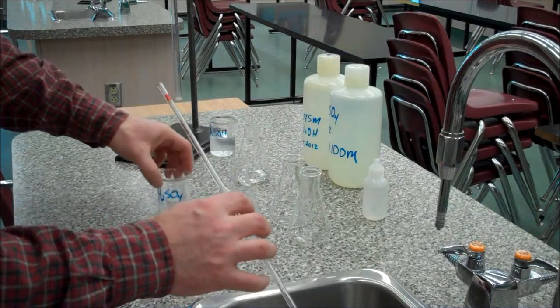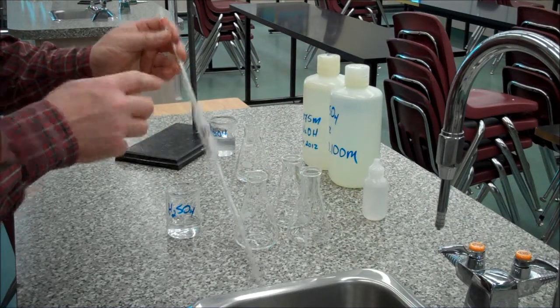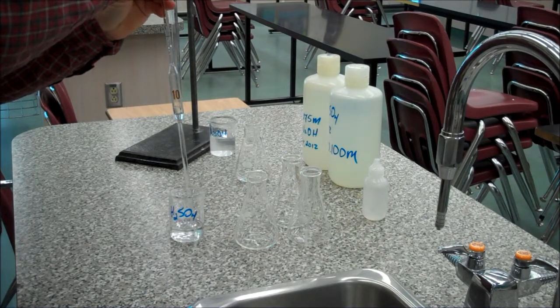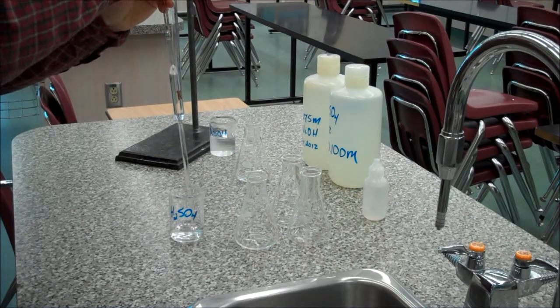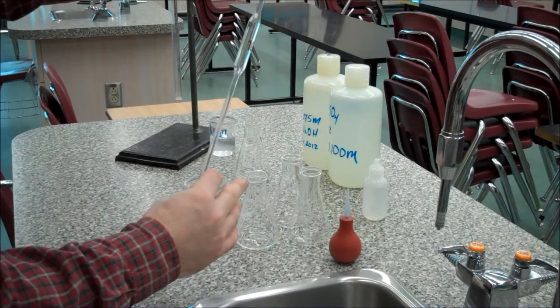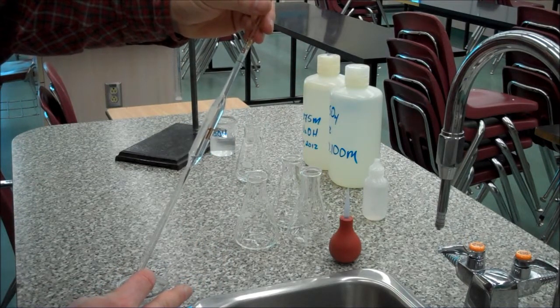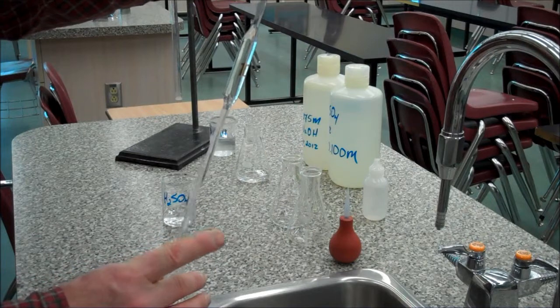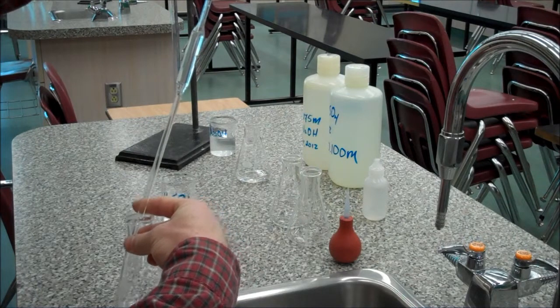Battery wore out. Okay, so I'm going to draw up my fluid above the single graduation and let it draw down. So, tipping the pipette over, drawing up beyond the single graduation, careful not to get it into the bulb. Whoops. Sometimes that's hard to catch when you let go. And touching to the side of the container, hopefully you can see the graduation, I let it drain down so the bottom of the meniscus is on the single graduation. Just like that. And now I touch the tip again to the side of my container, my Erlenmeyer flask. Hopefully you can see that. And let it drain down.